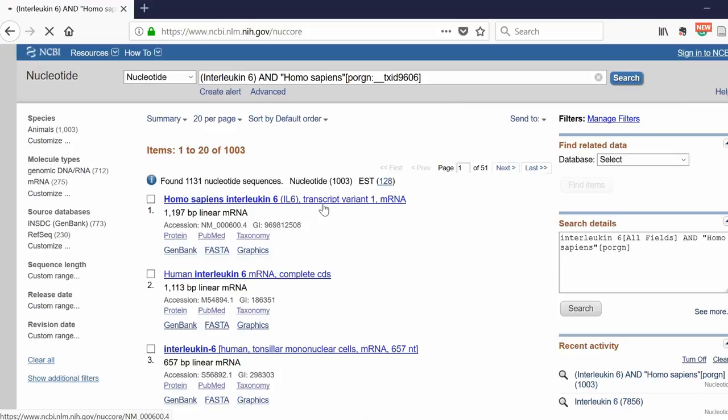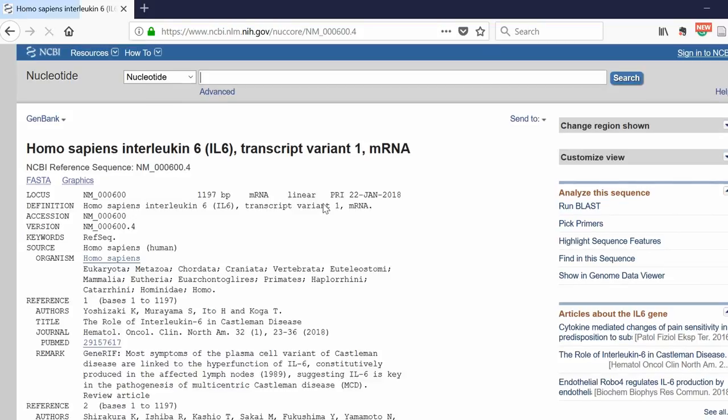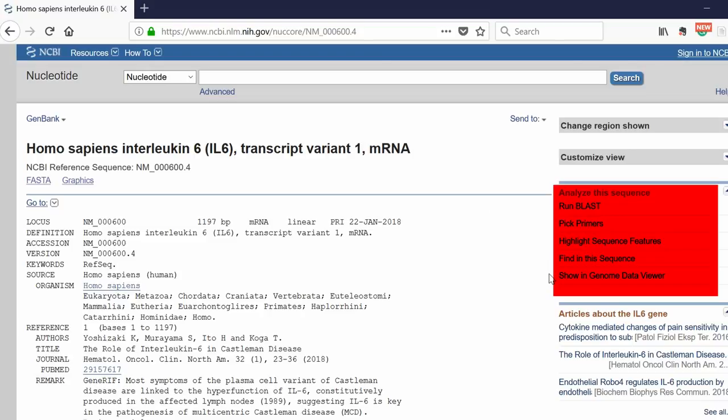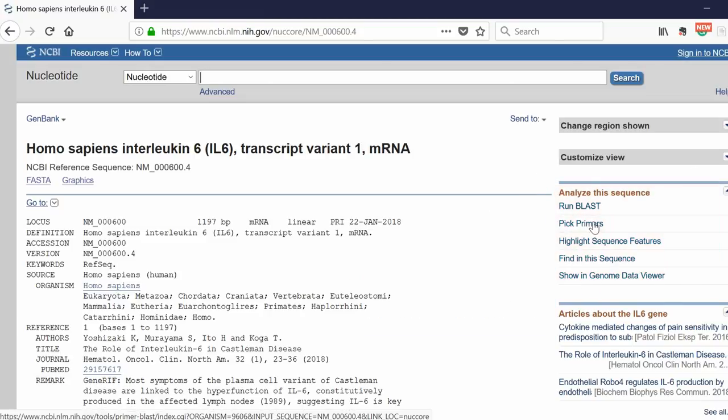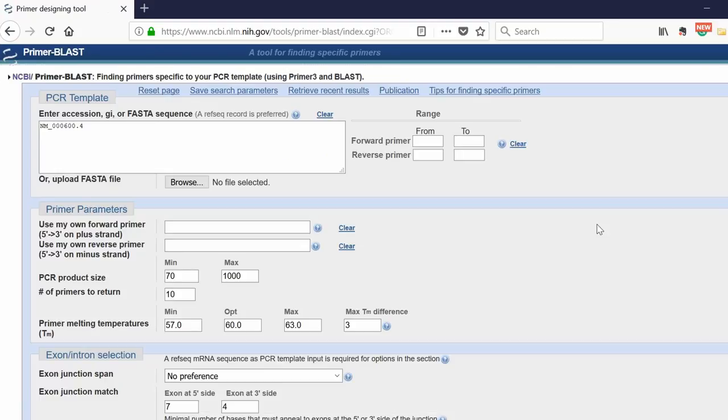This will take you to the page of this variant. On the right-hand side, you'll see a little box. You're looking for this option here, pick primers. This is the NCBI Primer Blast software. Click on this, and you'll be taken to the Primer Blast window.